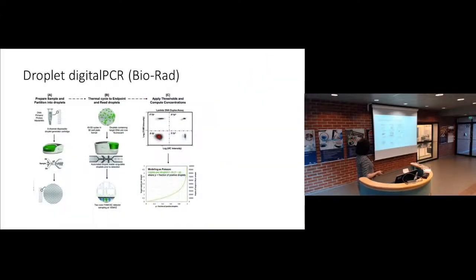Then people sometimes need to do digital PCR to get very sensitive detection of tiny amounts of the target, and to quantify how many molecules or genomes of a certain pathogen, for example, are in the biological sample. Normal PCR for some rare templates is not accurate or sensitive enough. So you can divide the PCR volume and your template into hundreds of thousands or even millions of tiny droplets, and then do the PCR within the droplets.